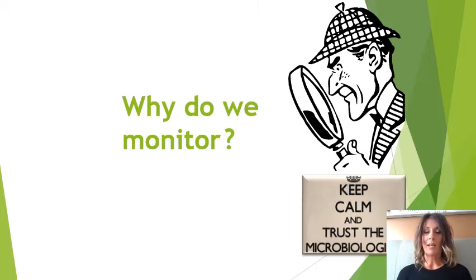And this is what we're focusing on today. Think about your surroundings in an aseptic production unit. What could introduce contamination? Unfortunately this isn't an interactive chat. We can't have this chat in person, so I'm going to run through a couple of things. Obviously you have your surrounding environment itself, the airflow, the quality of the air outside of the unit. You have the transfer of equipment and product and consumables into your clean room that can carry contamination in, and most importantly, the personnel, so people. We are the biggest contaminant of a clean room, therefore we carry in lots of viable organisms and particulates.